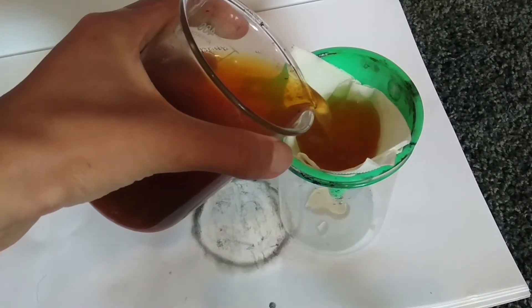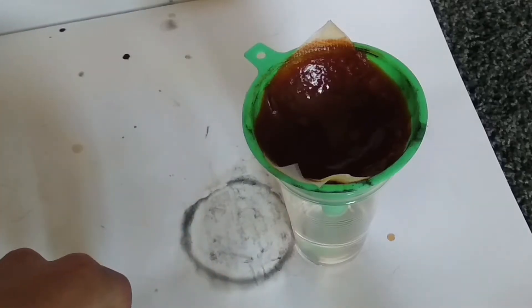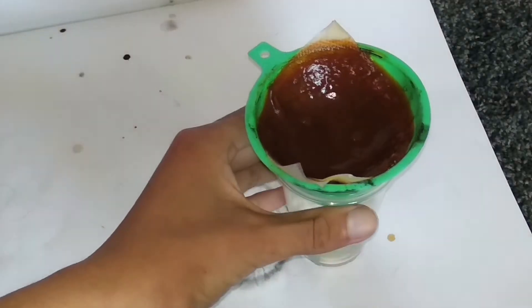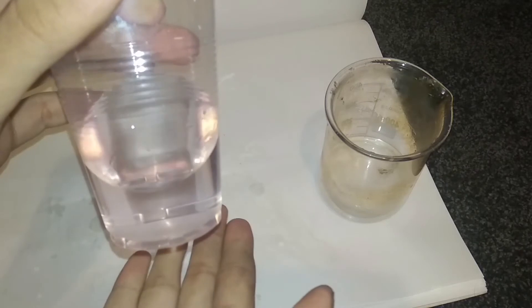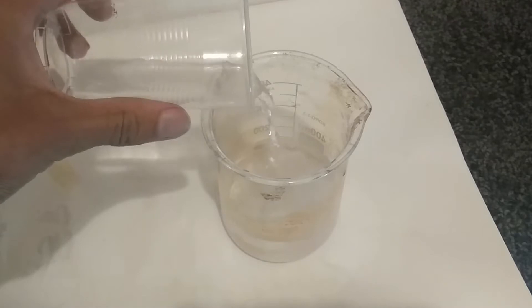After filtering, we can see that the solution is still yellowish, so I tried the process again in hopes that it was just highly contaminated with iron — which it was. Now we're left with a pink solution which shows a much more pure manganese chloride than what we had before.